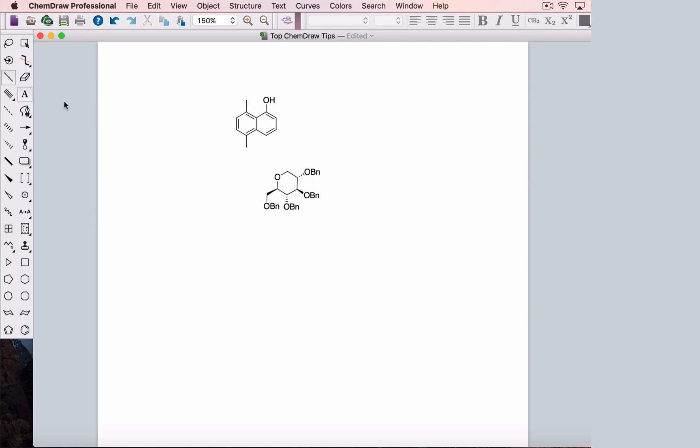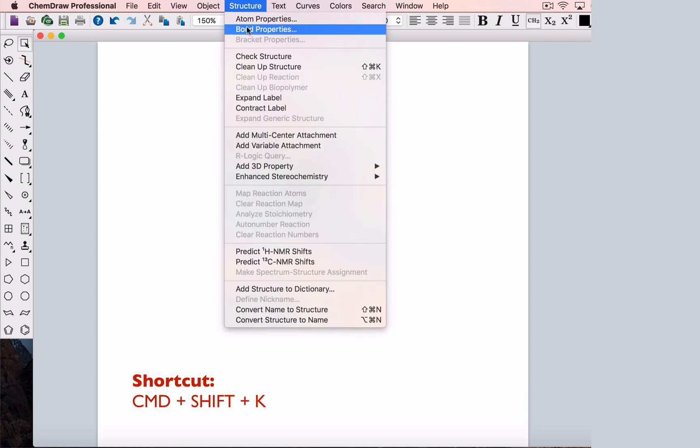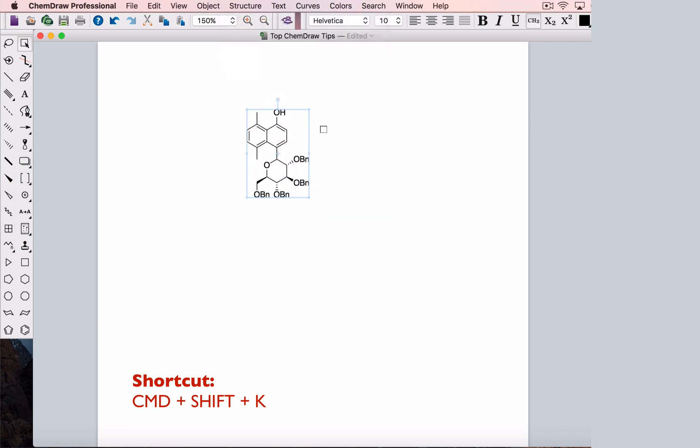Now, when I connect these two parts of the molecule, my bond is crooked and way too long. So, I'll click on the structure menu and clean up structure. ChemDraw automatically corrects bad bond angles and lengths. Now, I need to add some groups here.